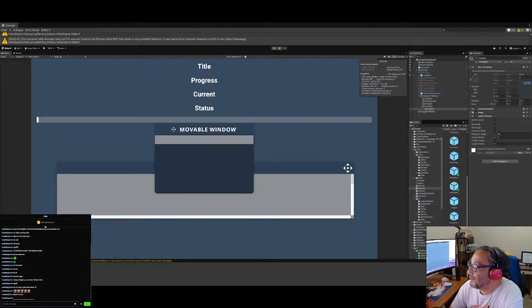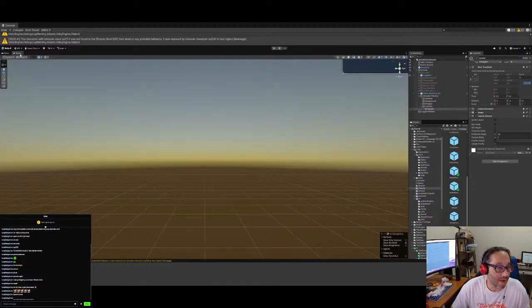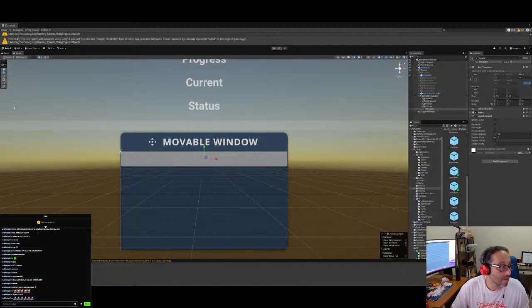So if you know the column name, like patient name, status, priority, whichever one you need for this particular thing, we'll do that here. Okay. So we'll go back to this. Go back here. Go here, and then we'll do this. You're gonna right click here, right?